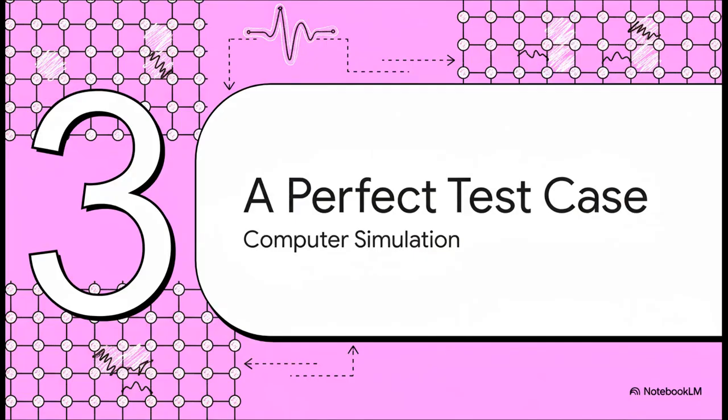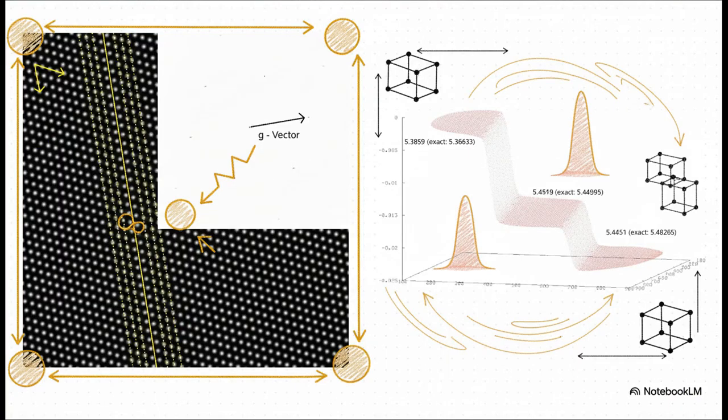Now, okay, when you've got a revolutionary new tool, what's the first thing you do? You don't just throw it at a real-world problem. You have to test it, right? Make sure it actually works. So the researchers started with a perfect computer-generated world, an atomic lattice where they put the flaws in themselves. And this slide just shows it perfectly. On the left, that's your input. It's a flawless, computer-made grid of atoms, except for two little defects they added on purpose. And that arrow, that just tells the program which repeating pattern to focus on.